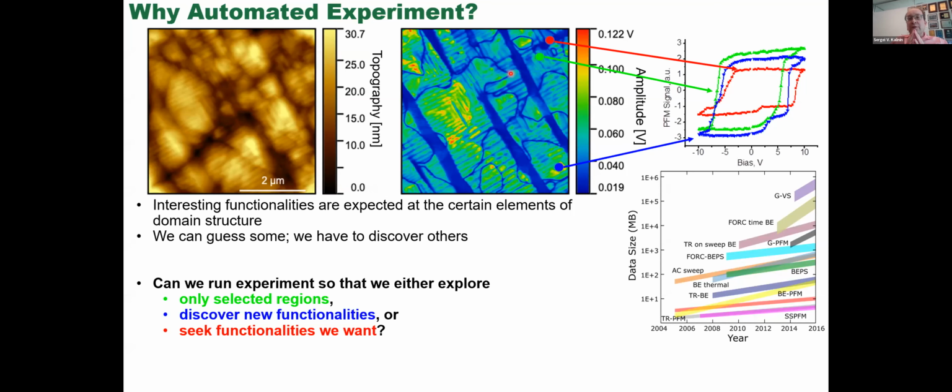So notice what this discussion means. It means that when I'm running even a simple microscopy experiment, my reward function, so what I'm interested in, changes continuously during the experiment. I start with the instrument calibration. I proceed to the characterization of the statistically significant part of the surface.